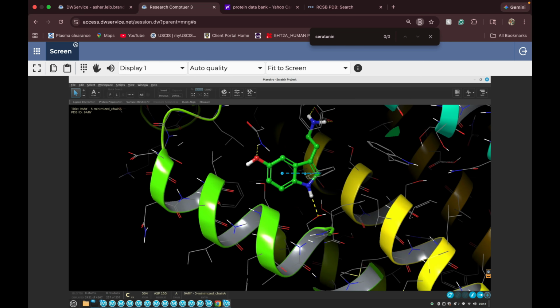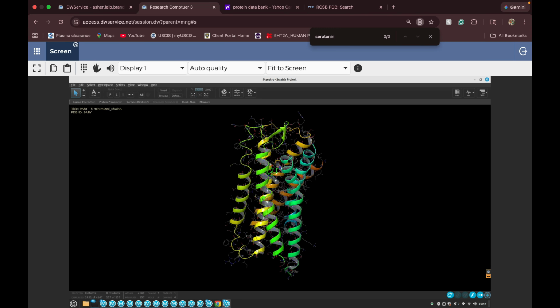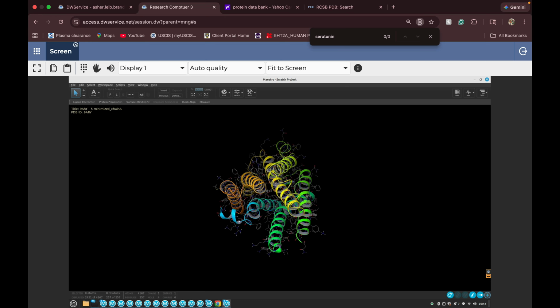And on the bottom of the receptor, in this bottom part, this is where the G protein binds in this middle cavity. The idea is I want to run a tool called SiteMap, which will hopefully identify that as a potential binding site. So basically what I'm going to try and do is design a drug that binds to where the G protein would interact with the protein.